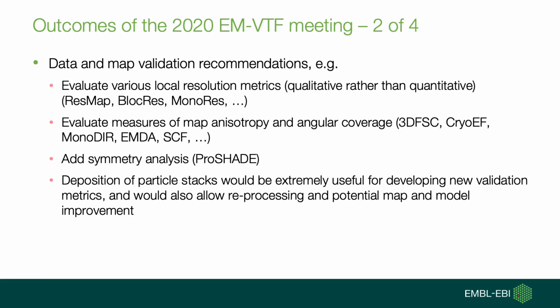With respect to data and map validation, we got recommendations to evaluate a number of programs that assess local resolution, and also programs that look at the map anisotropy and angular coverage of the particles. There was no clear favorite in either of these areas, so the recommendation is to implement a number of them and run them on the entire EMDB archive and see how well they perform. There was the recommendation to add symmetry analysis, and there's a program from Garib Murshudov's group, ProShade, which does that.